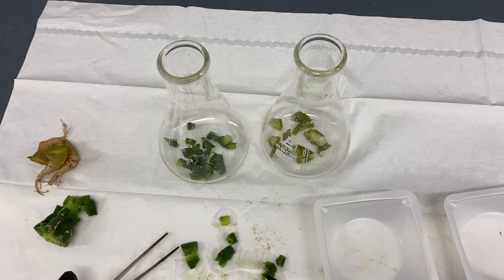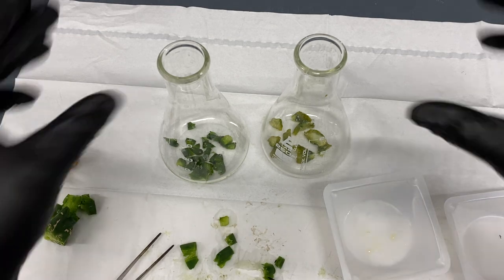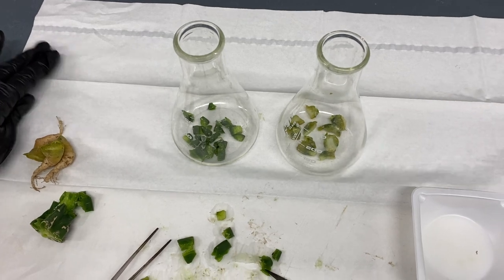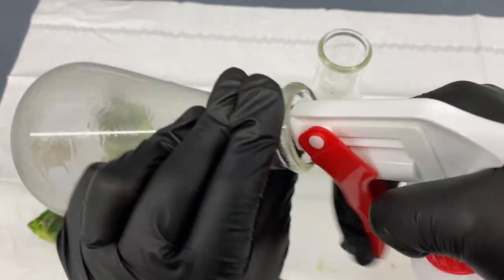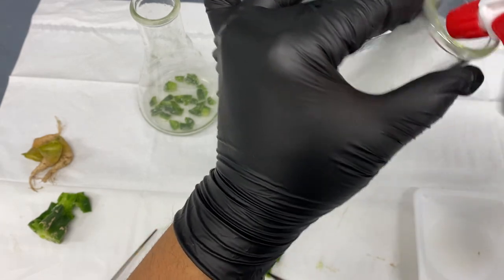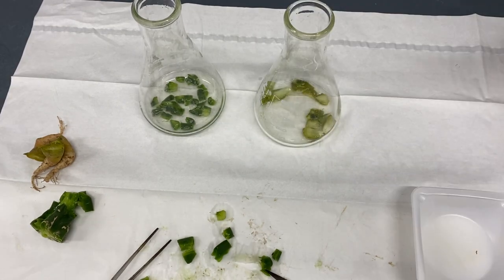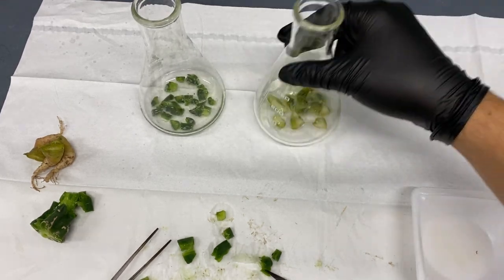I have a video already on how to do the surface sterilization, but I'll show you quickly what I do here. The first thing, because it's very hardy, I'm putting it in 70% isopropyl alcohol — this hopefully kills any external bacteria and some spores. We're only going to have it in here for about one minute to one minute 30 seconds. Always check your tissue to make sure it's not dying off, and lower the time or concentration of the chemical if needed.